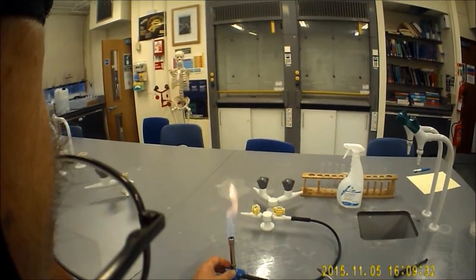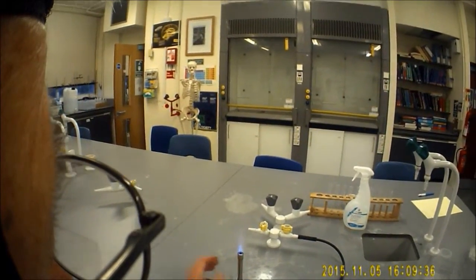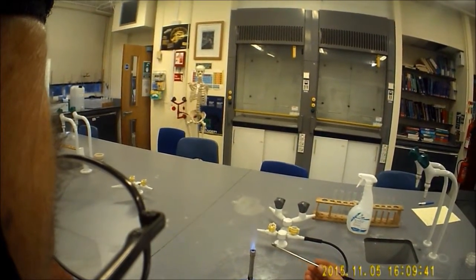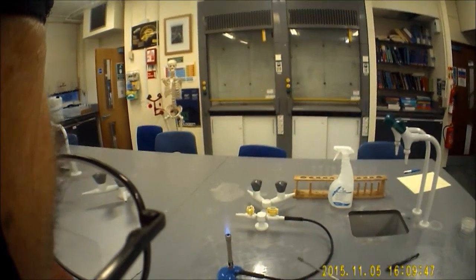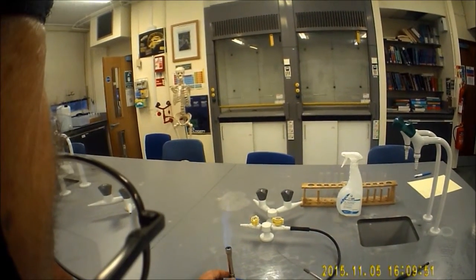So this is the wire loop which I'm going to sterilise. I'm going to turn it round to a blue flame, and I'm just going to pass the loop through the flame, like so. You don't need to get it to white heat. It doesn't need to be melted, but that will now kill off any bacteria that we've got on the loop. I'm going to show you the procedure for preparing a streak plate.